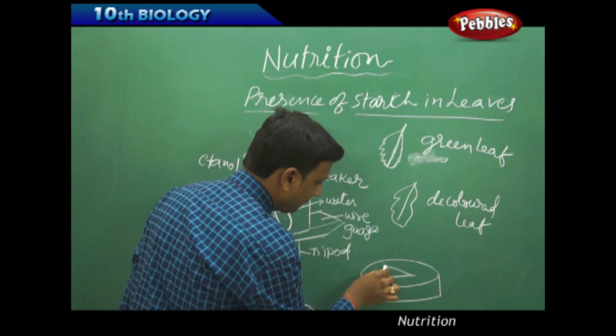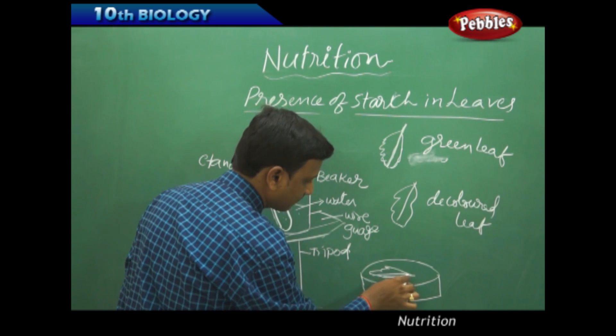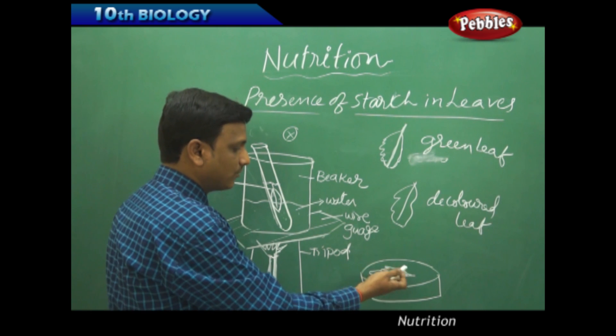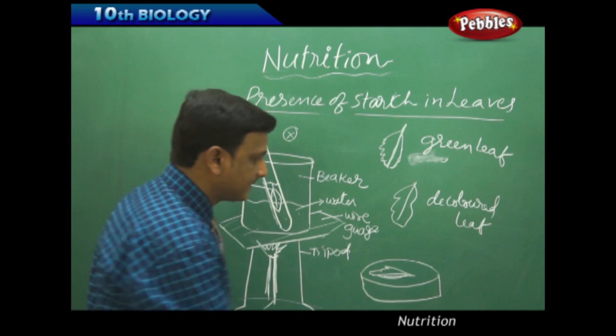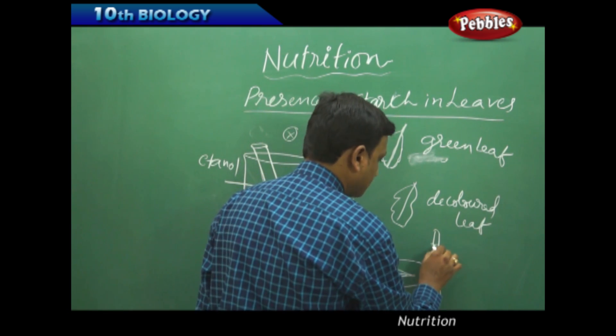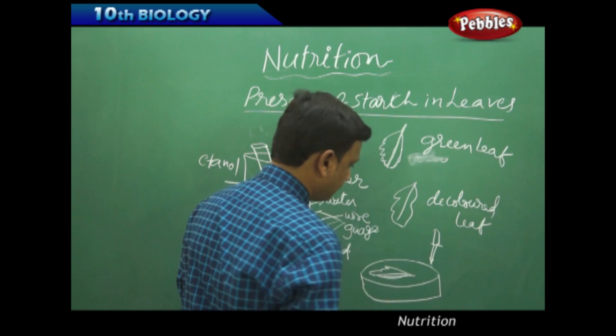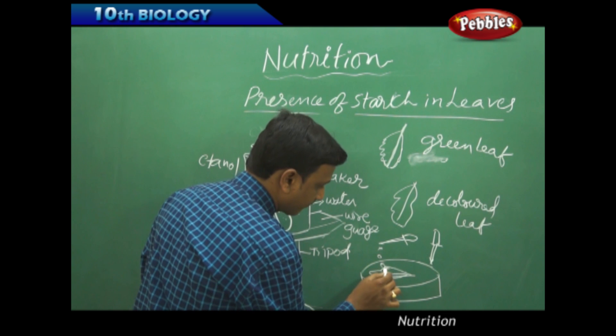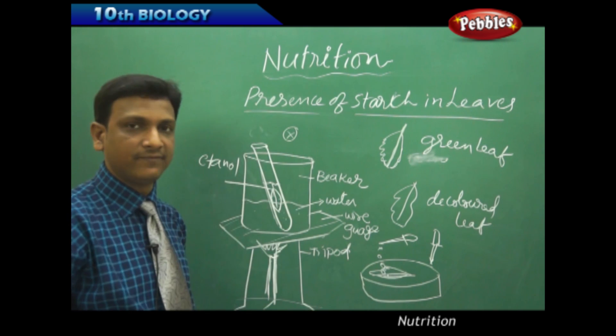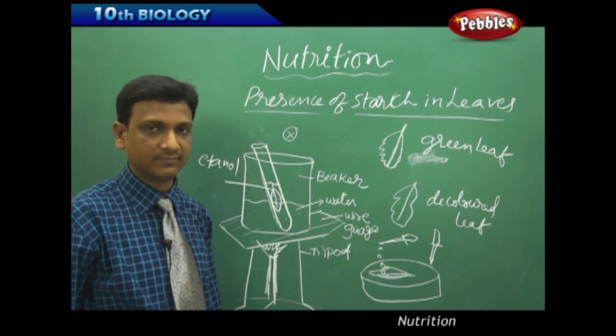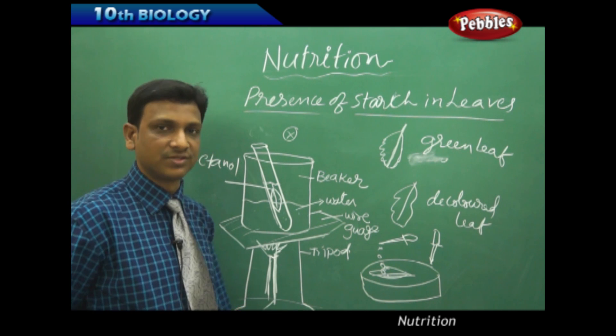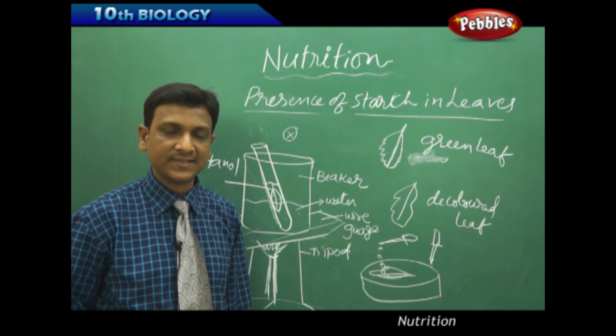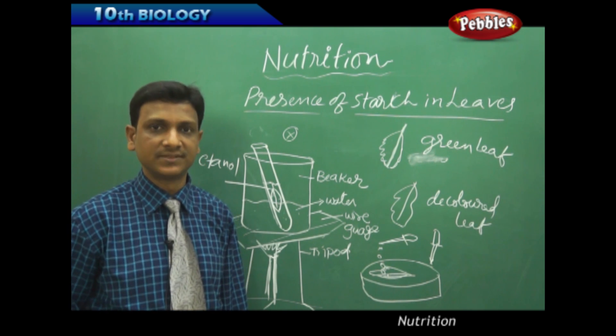This decolored leaf is placed in a petri dish. We can add some water to remove the alcohol. Then add few drops of iodine. If you add few drops of iodine, the leaf turns dark blue in color. So it indicates the presence of starch. By this experiment, we can prove that starch is present in green leaves.